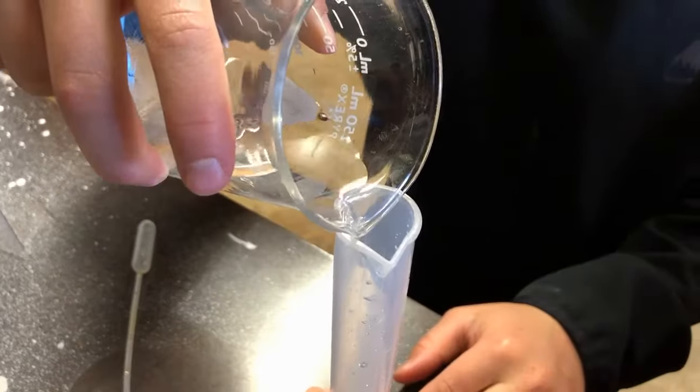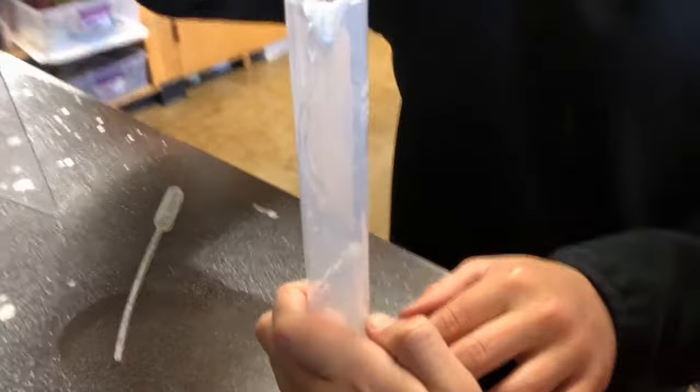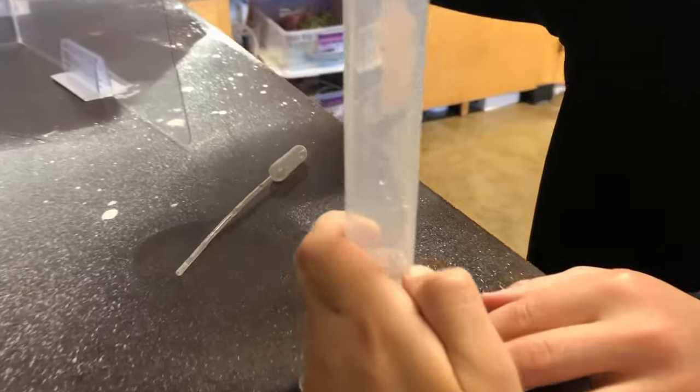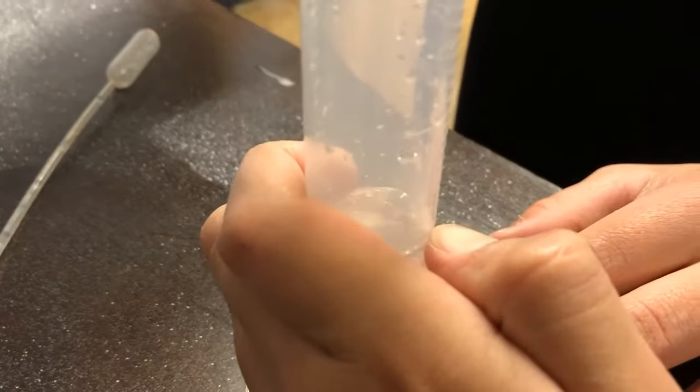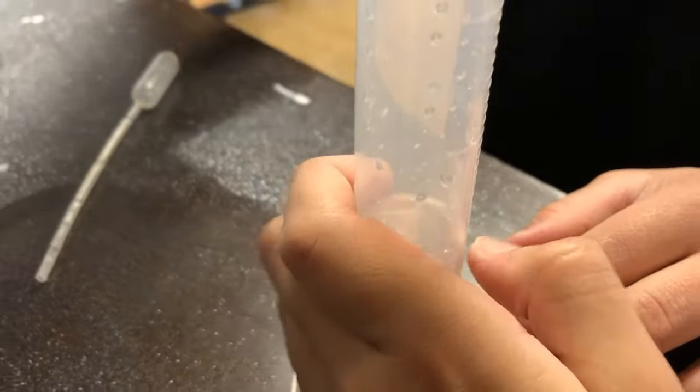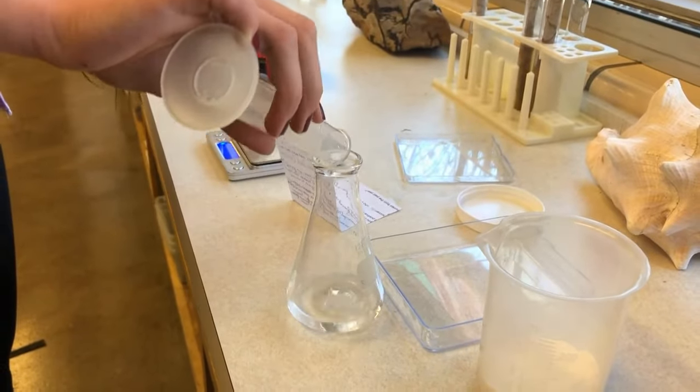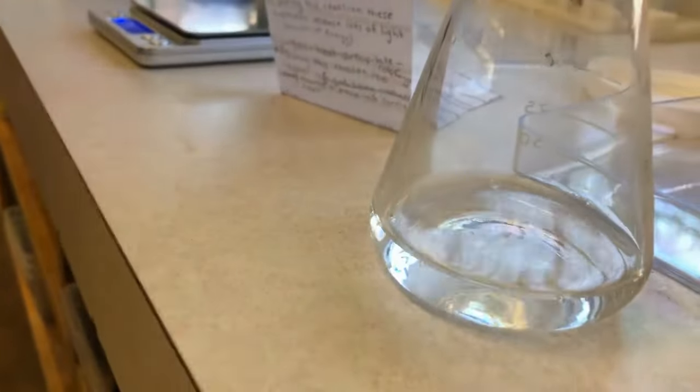To begin with, in class, students measured 20 milliliters of vinegar using the graduated cylinder that you can see there in the video. They then transferred that into an Erlenmeyer flask. The clear liquid at the bottom there is our vinegar.